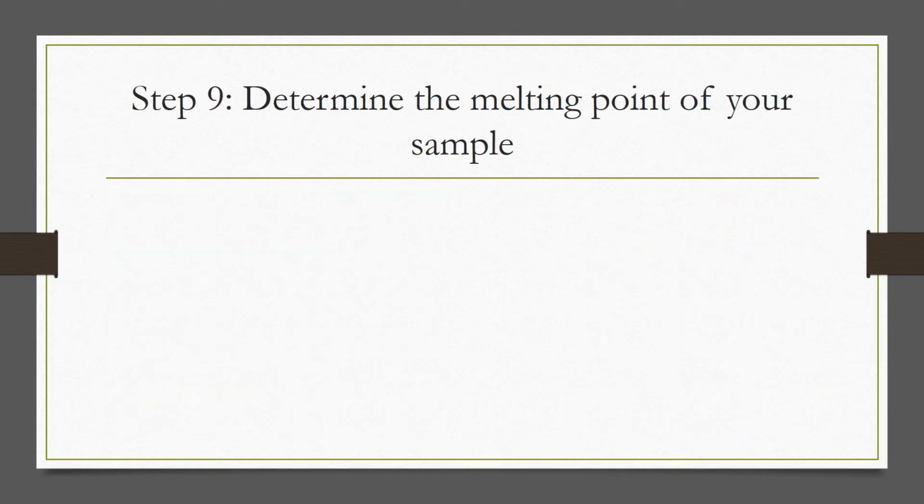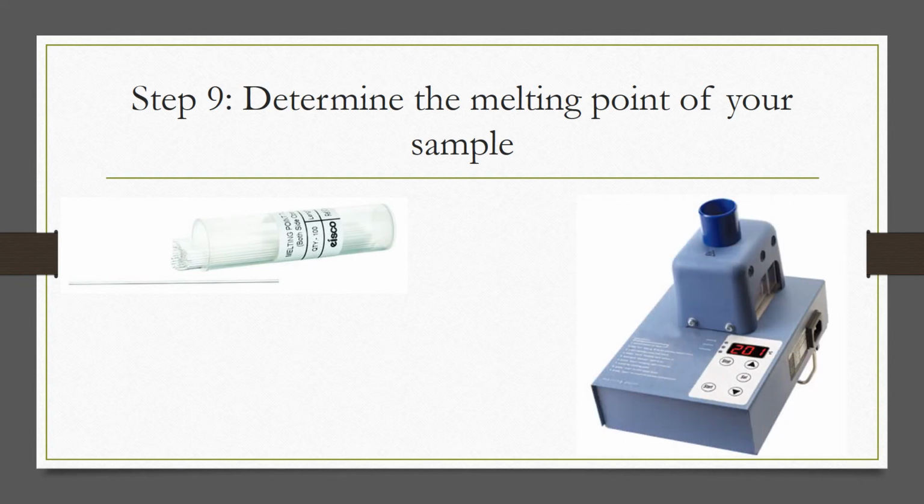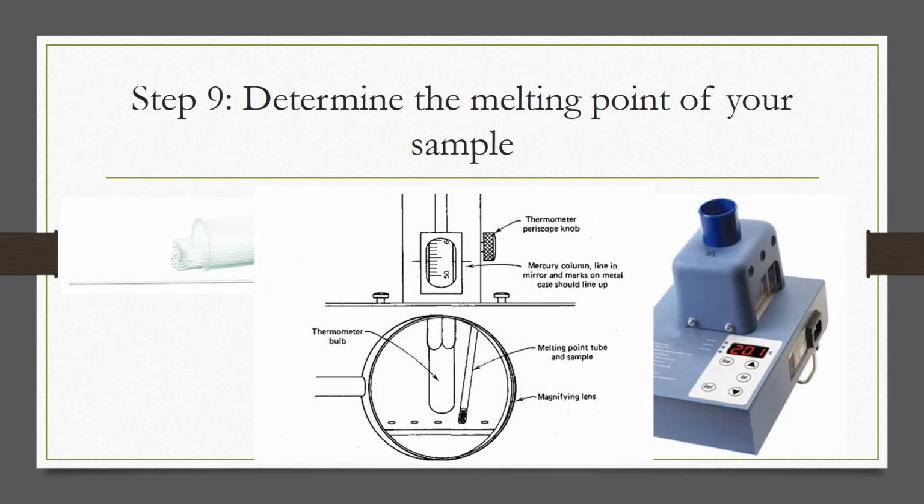Step 9. Determine the melting point of your sample. To determine the melting point, we heat the substance in the melting point apparatus. Tap a small amount of your crystallized sample into a melting point tube and then insert into the apparatus. Record the initial melting temperature and the temperature at which the sample is fully melted.